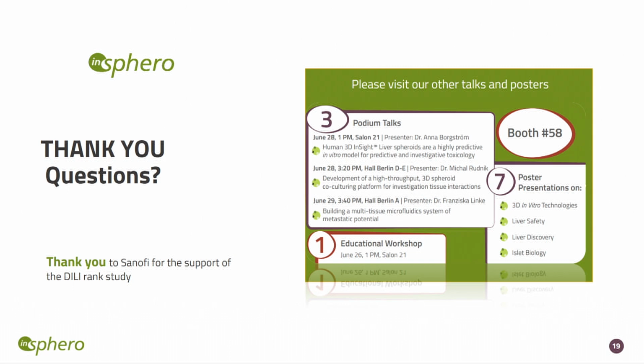Hi, Erin Gallagher, U.S. Army. How often do you change pooled lots? It depends on how many productions we have and how much we sell, but we would say that something between 1 and 2 years we stick with the same lot. Since it is a multi-donor lot, we have a lot of cells. So every year or every second year, we are transitioning to a new lot. And in between, we do bridging studies of a certain set of reference compounds, and we also do all these characteristics of the metabolism and the transporters or expression of cells.